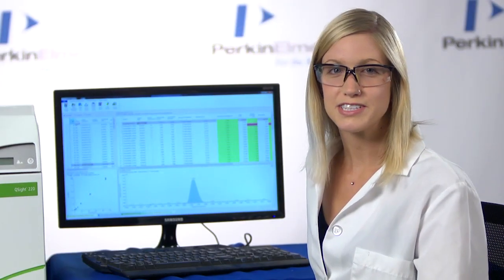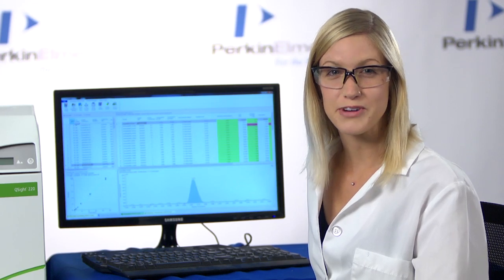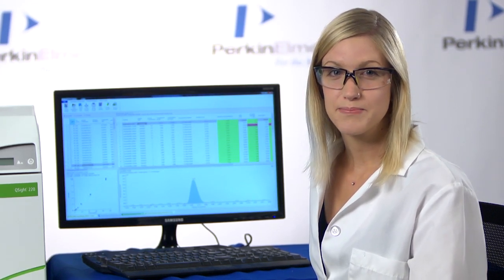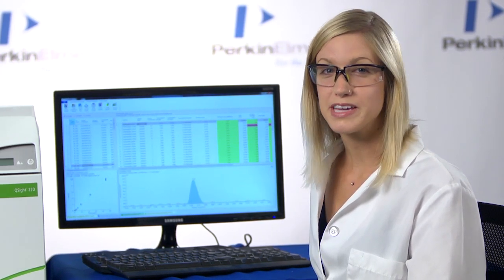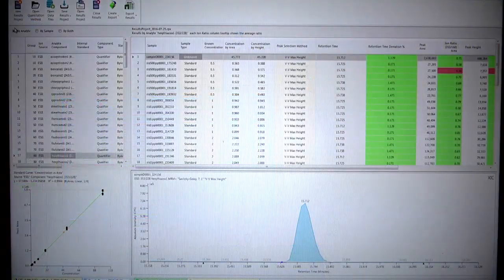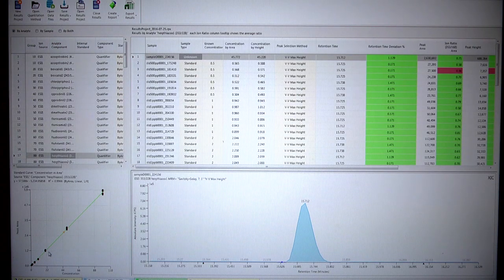This is the result table generated by the Quantitation software. The table can be organized by analyte, by sample, or even both. Here are the calibration curves that have been created. Any outliers will be flagged.